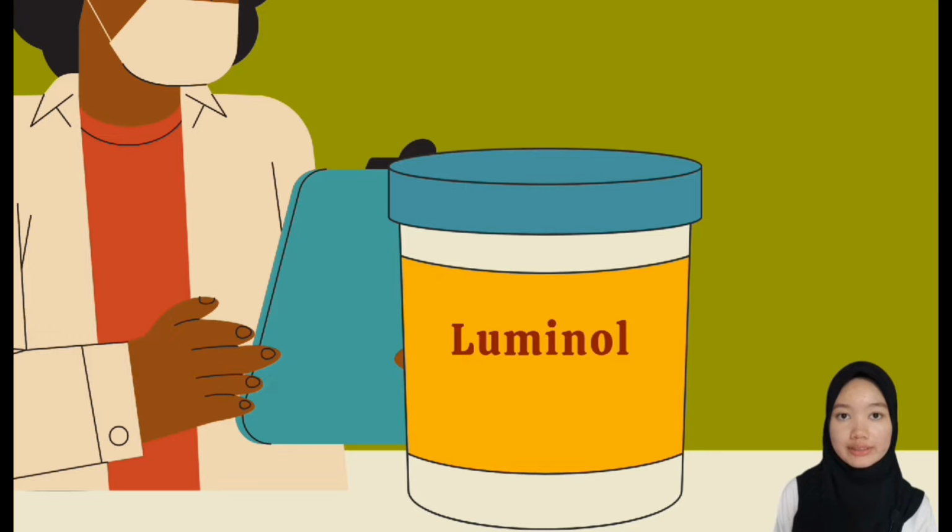Now we move to the second presumptive test for analyzing blood, which uses luminol solution. Let's say we have a murder case, and a murderer disposes of the victim's body and mops up the pools of blood. Without some heavy-duty cleaning chemicals, some evidence will remain. Tiny particles of blood will cling to most surfaces for years without anyone ever knowing the blood is there. Hence, we use the luminol test.